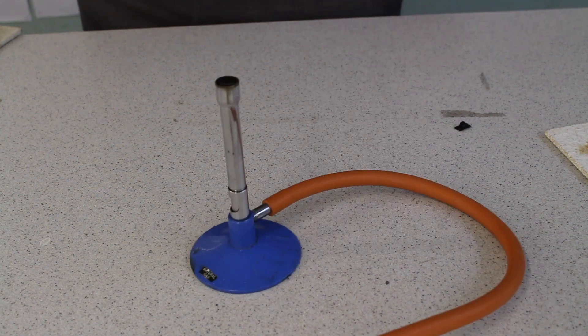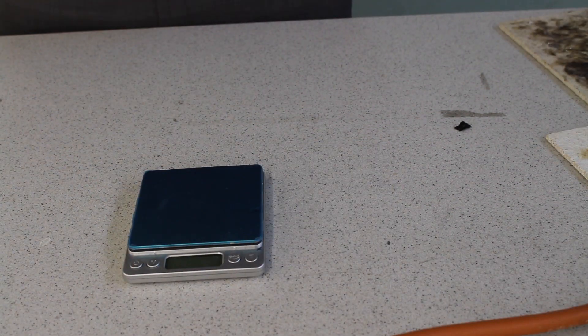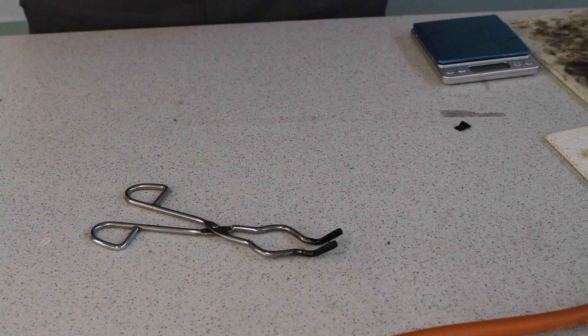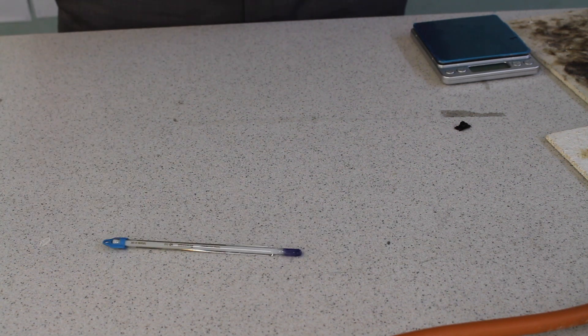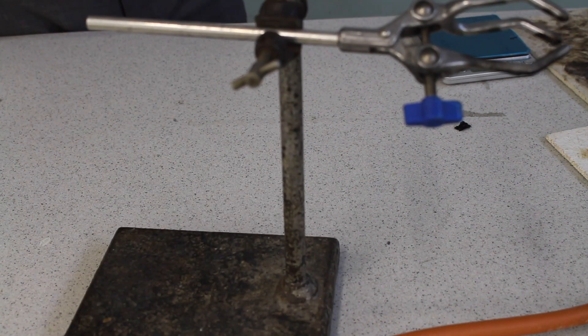Equipment that you're going to need for this experiment: Bunsen burner, heatproof mat, a balance, a boiling tube, tongs, a thermometer, water, a measuring cylinder capable of measuring up to 20 centimeters cubed or above, and a clamp stand.